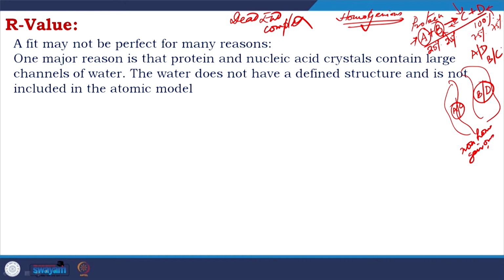This is called the dead end complex used in protein crystallography. So, why am I talking about that? When we are doing that, it is out of your possibility to check whether your protein is actually active or not in the crystal structure, because you have given dead end complexes. So, they are not reacting anyway.